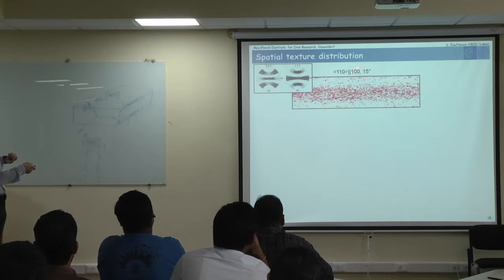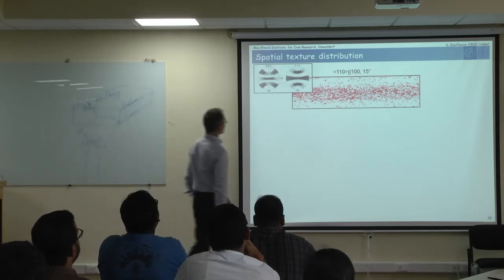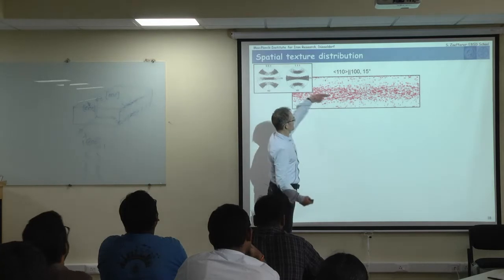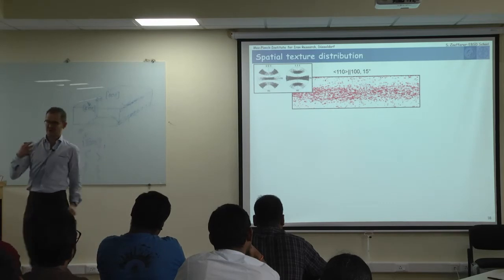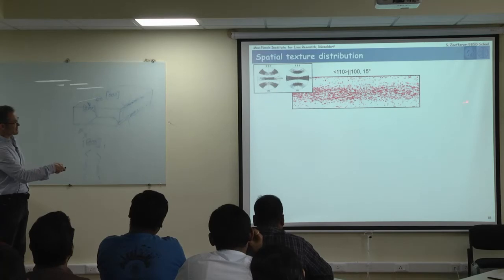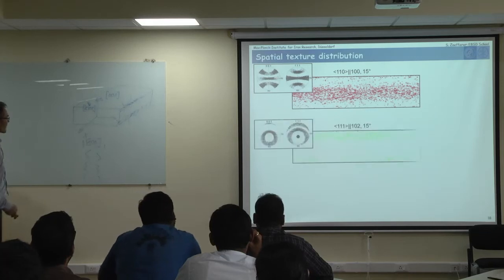point into the direction 100 of the crystal, and the 100 direction, let me guess what that is. 100 is probably this direction here. I didn't plot it here. Again, a mistake when you print such things in your thesis or in a paper. You should always make a little coordinate system next to it, showing where X and Y are.